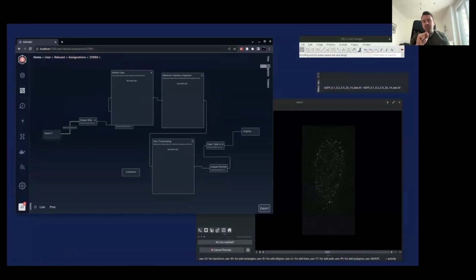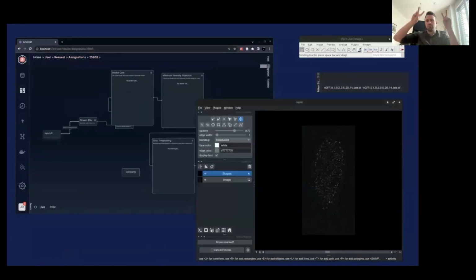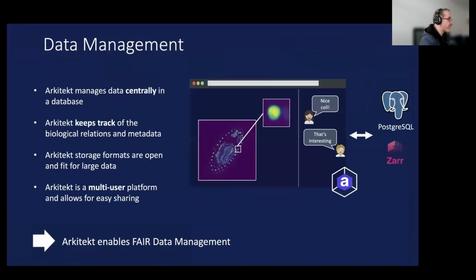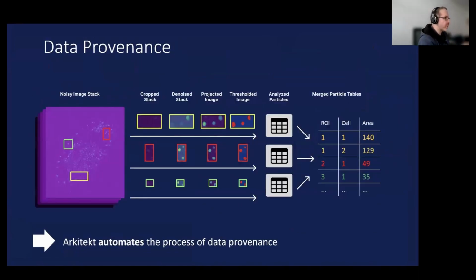The problem is you also need to give access to your data then, because this run is just a sort of reference to these different data points, but it doesn't show them. So for reproducibility, you will not put all the data you use.